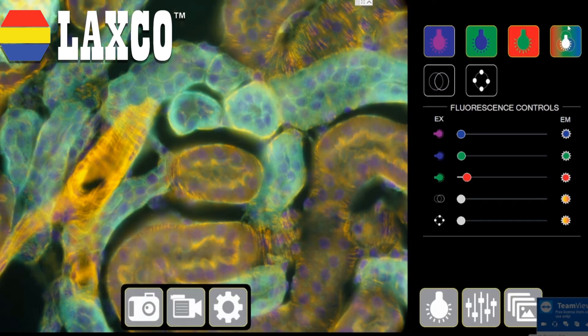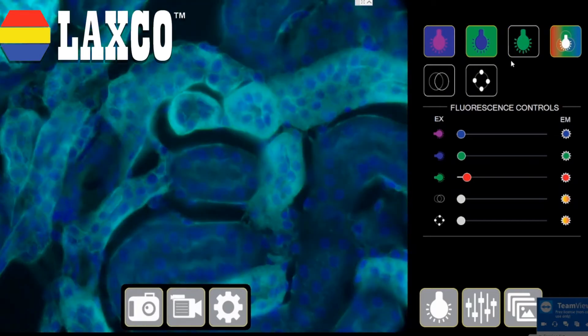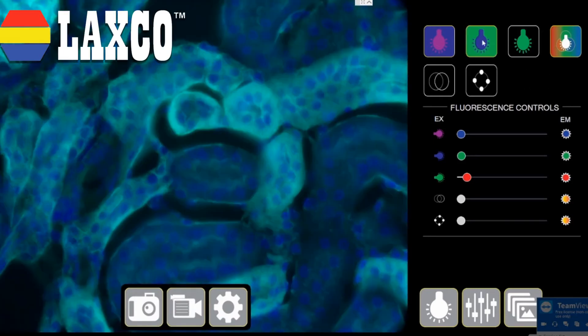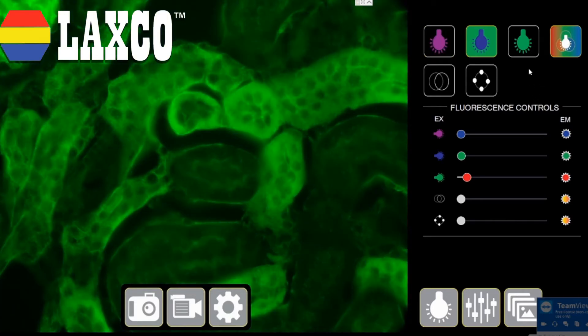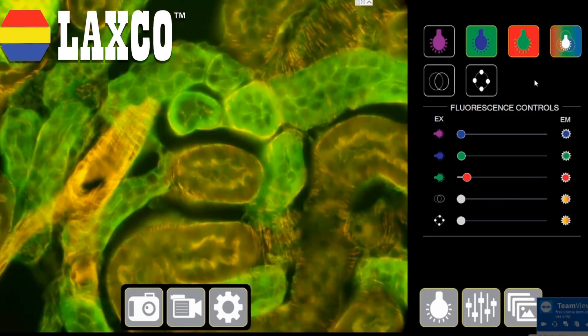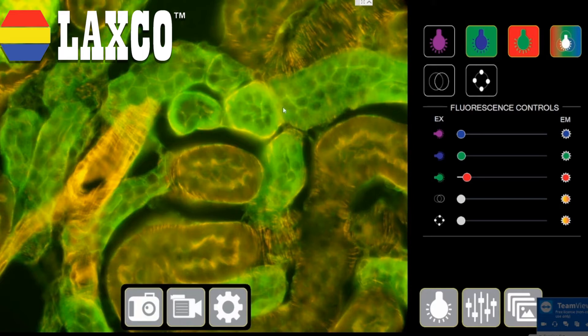Currently I have all the channels turned on with multi-channel mode on. Let's turn channels on and off and see what happens. The software also gives you the flexibility to control the microscope through the computer. I turn off the red here, now I'm turning off the green channel, and this is just DAPI — see the level of detailing you get. You can also combine channels like combining green and blue. Now I'll turn on red, turn off the green, and you have only the red channel. Even when you have two or three channels combined, the detail is just amazing. No crosstalk and the level of detailing — that's the strongest point of this software.